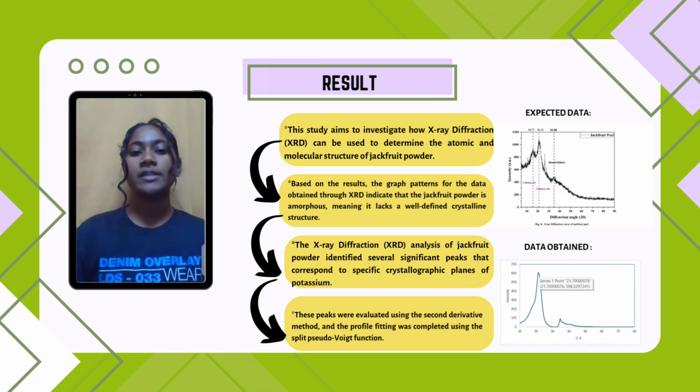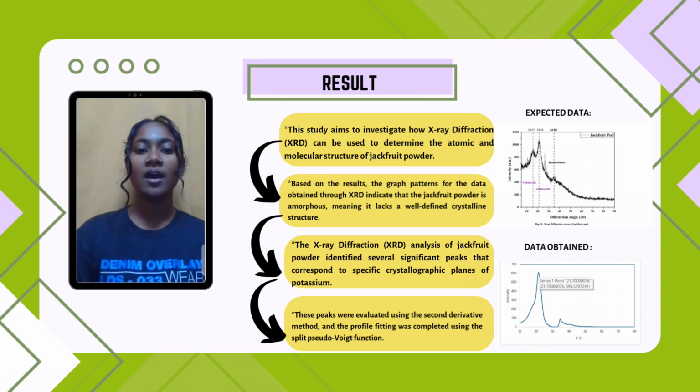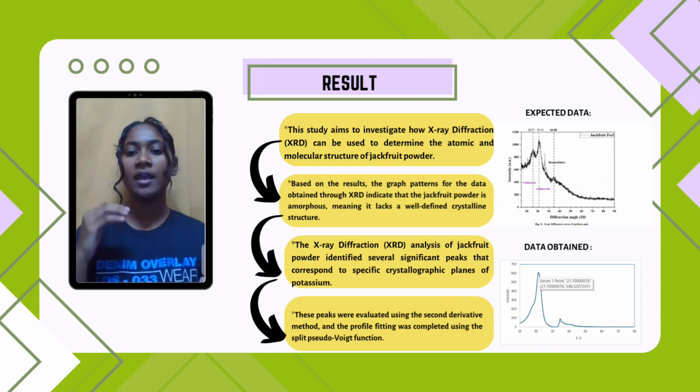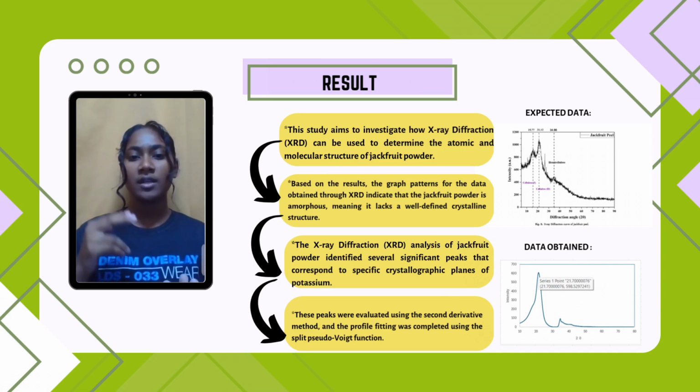Crystalline cellulose produces sharp peaks in XRD analysis, while amorphous materials result in broad patterns. The particle size of the jackfruit peel powders was also measured. The diameters range from 170 nanometers to 446.80 nanometers with an average of 298.54 nanometers.